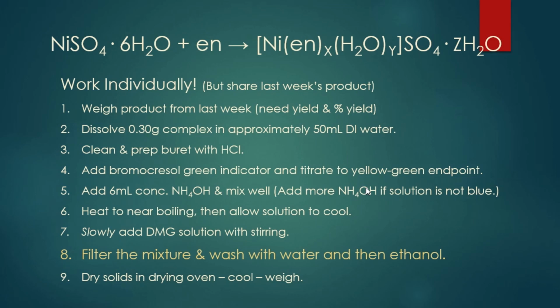But during that 20-minute heating period, that's a good time to clean everything else up, because at this point, all you're going to need to do is pull this out, let it cool, and then you're going to weigh it. And once you have the mass, we're done in lab.